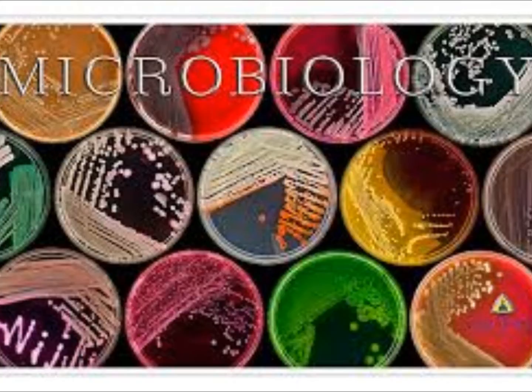differentiate? Like, whenever you say this is what the organism is, it's, you know, out there. Yes, so when we're assessing the bacteria, when we're doing the morphological characteristics of an organism, you have a worksheet. And on your worksheet, it'll be divided into your medias, so you'll have a blood agar plate. And you record the morphological characteristics of the organisms on this worksheet. And so you will record the hemolysis.